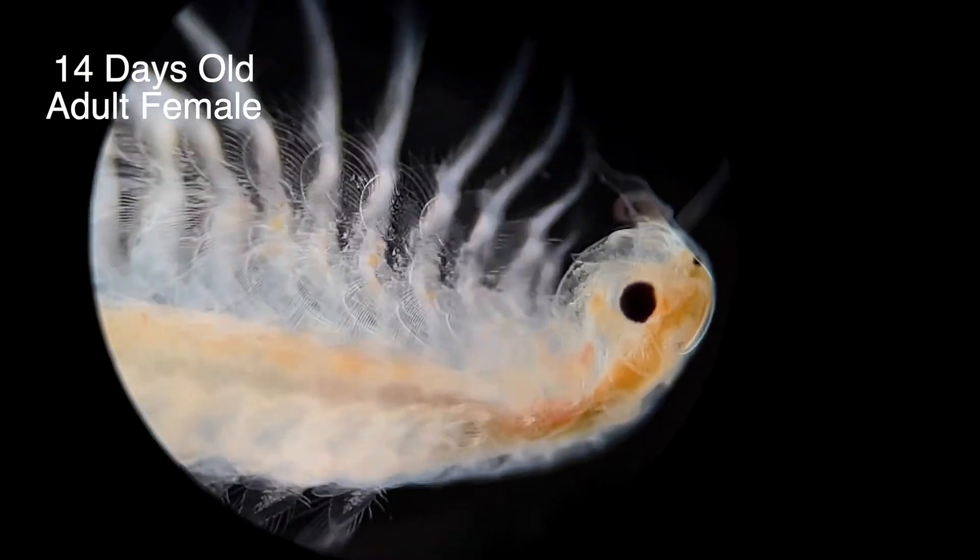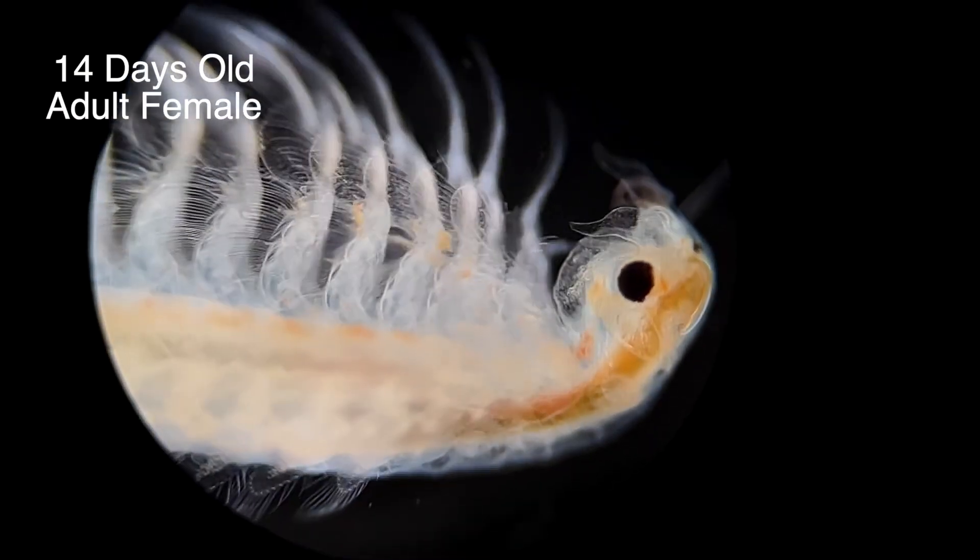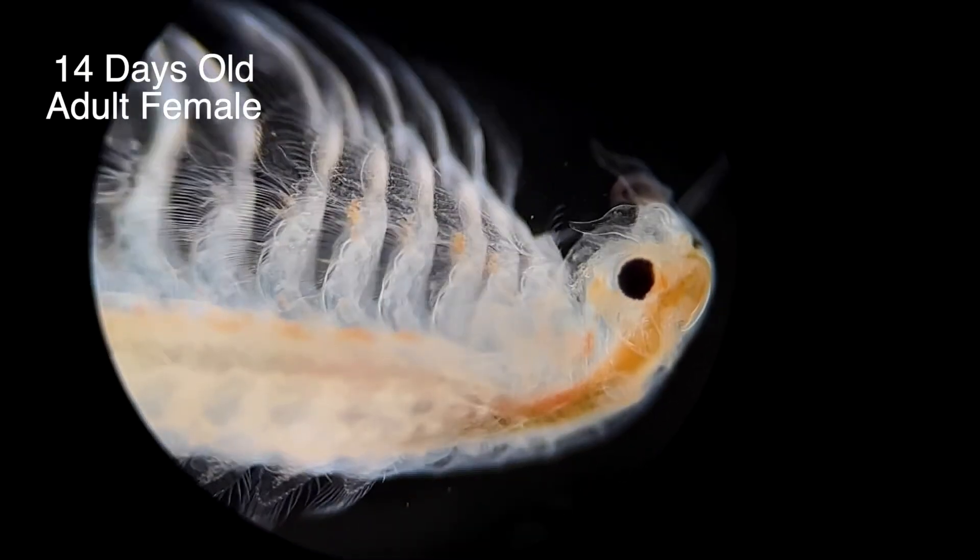Adult females become very long — in fact they're the larger of the two sexes. The antennae on their head remain small though and simply have a sensorial function.